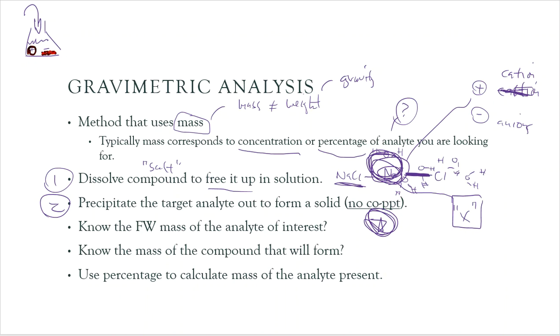And that's precipitating out onto the bottom of the flask. And now, really what I need to do is I need to get rid of the solvent and I need to filter this solution. And then the solid, I can then dry and I can weigh or get a mass of it.